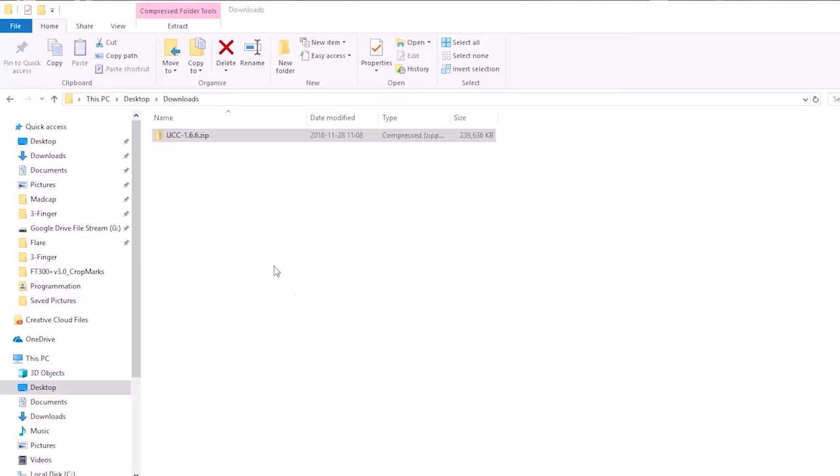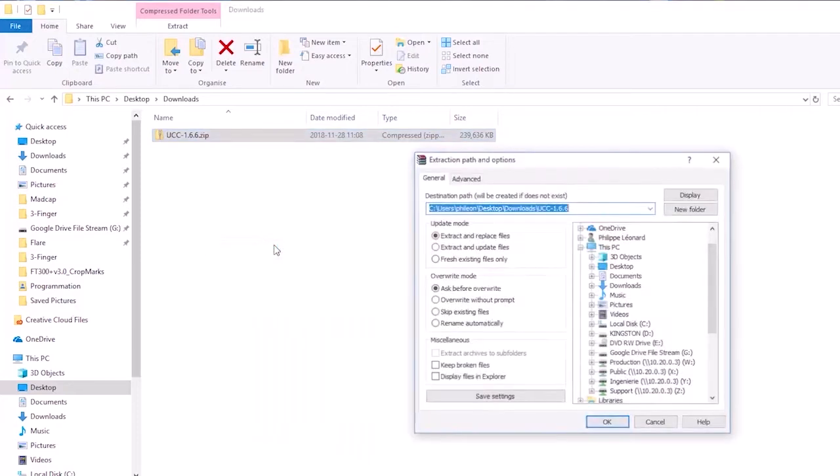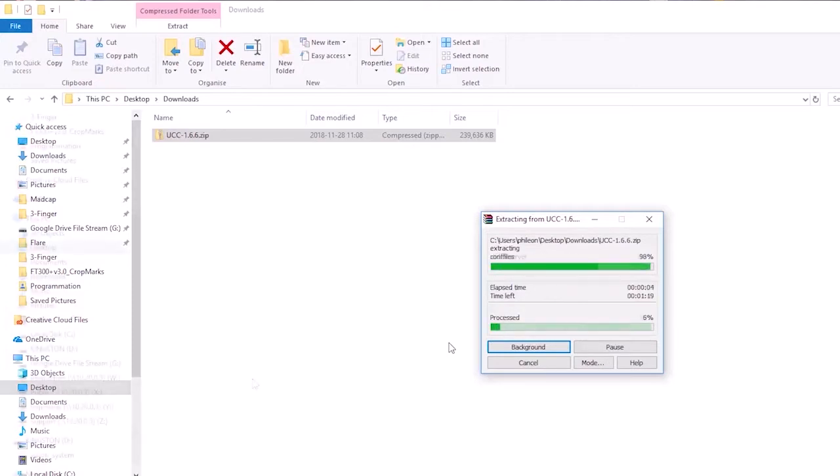Connect a USB storage device to your computer. Find the compressed file on your computer and extract its content at the root of the USB storage device.